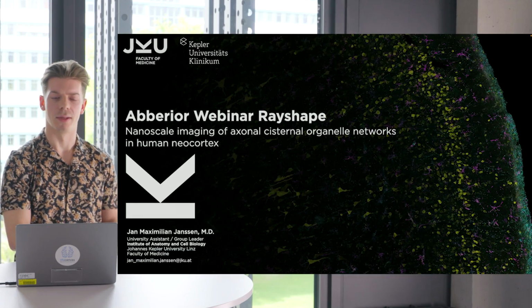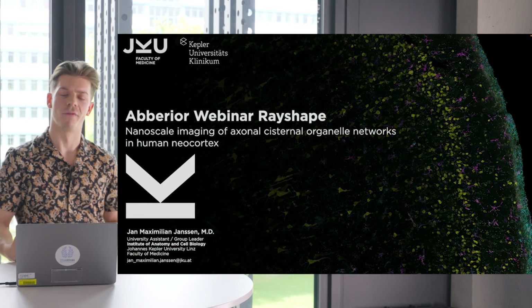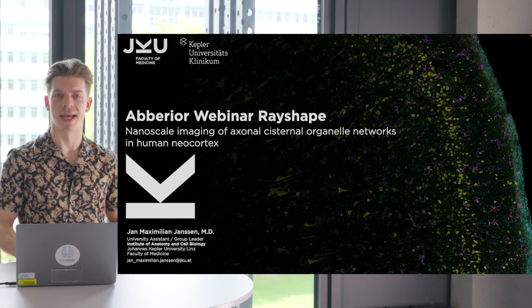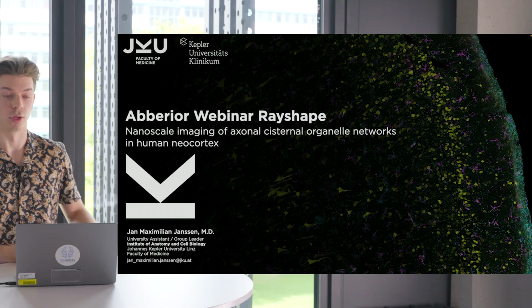Hello again, and thank you to Abberior for coming over here today to film this webinar with us at JKU Linz, Austria. I want to start today by briefly talking about the backstory of our research and why we use nanoscale imaging to answer certain questions about neuronal behavior. Starting with the topic, I want to briefly talk about neuronal activity and synchronous behavior.